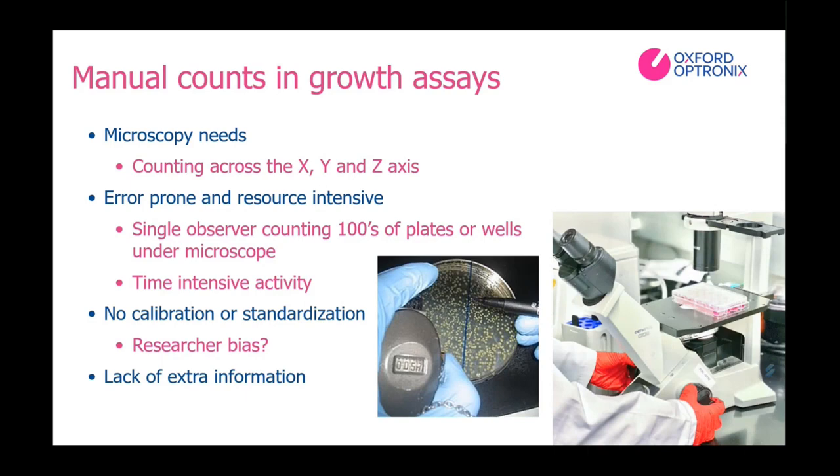Further, since organoids are grown in 3D space, this requires a researcher not only to be methodical across an X and Y axis, but they must also be wary that the Z axis must also be considered so as not to miss a substantial number of organoids at differing levels. None of this is particularly easy to do in 3D space. Do note, this requires a highly trained individual, as it's not a particularly simple task, and overlapping objects are almost impossible to count. Regardless of a counter's efficiency, this will inevitably be an extremely time-consuming responsibility.